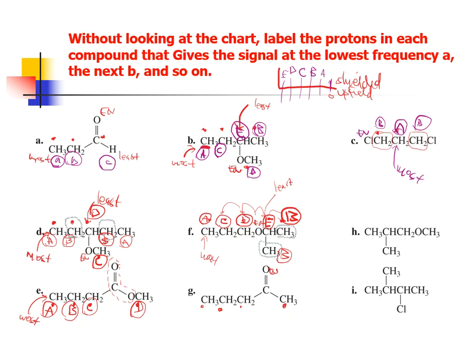And then for G, the furthest away from that electronegative atom, well, the most shielded that it's going to be, right? So it looks like that's the CH3 group over here. So this is going to be the A signal that I want to label, closest to the TMS, lowest frequency in order to get it to flip, based on how this example problem was worded.